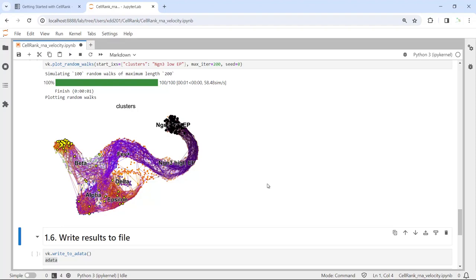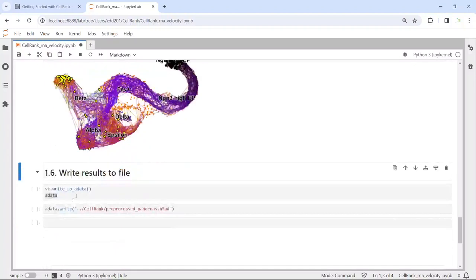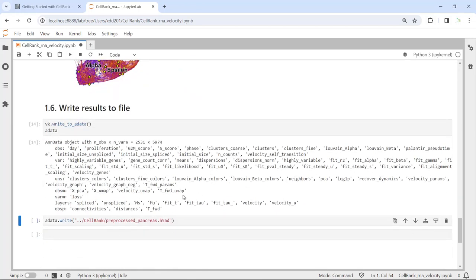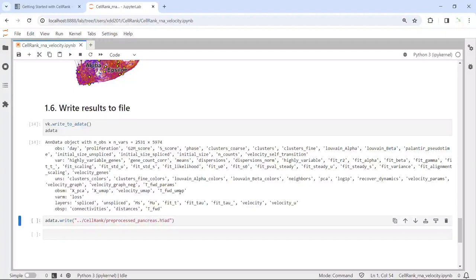We performed the scVelo RNA velocity analysis for the pancreas dataset and computed the transition matrix. Now we can write the transition matrix data into the AnnData object. Looking at the AnnData, we saved the transition matrix data in the observation pairs, in the T_fwd data slot. This dataset now has PCA and UMAP from Scanpy analysis, PCA and UMAP for velocity analysis, UMAP for velocity, and UMAP for the transition matrix calculated by CellRank. We can now save the data.